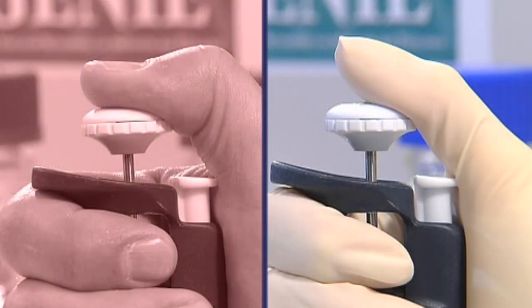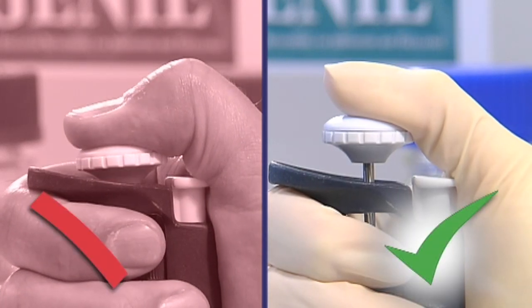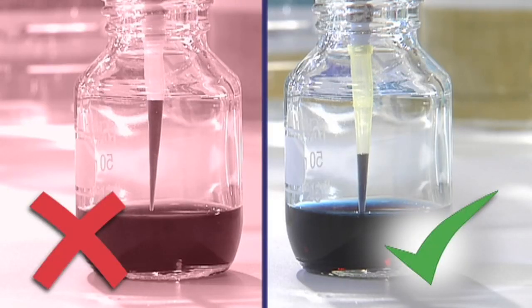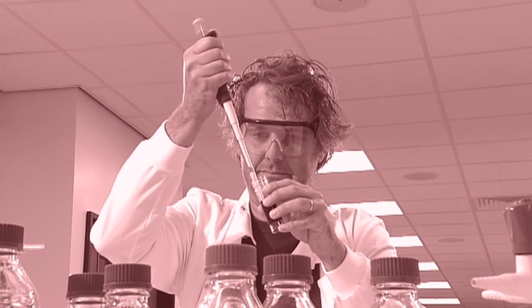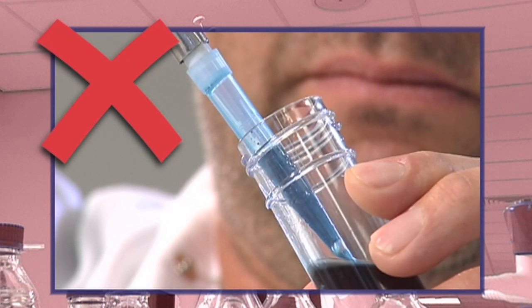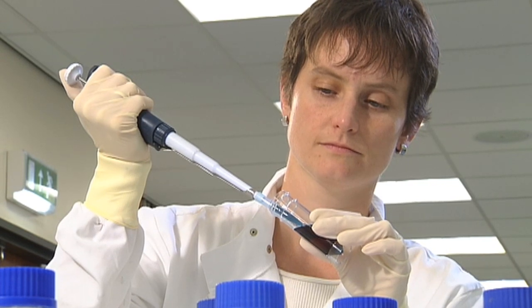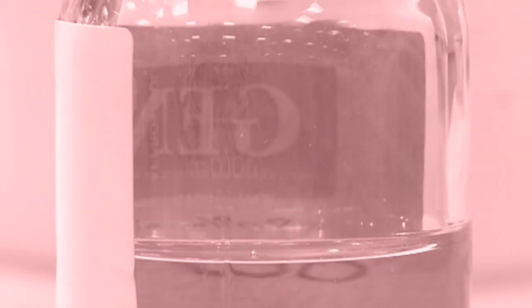When pushing down the push button to take up liquid, don't push past the first stop — if you do, the volume you take up will be too large. When taking up liquids, don't simply let go of the push button, as the liquid can be sprayed around the inside walls of the tip and up into the pipette body, causing inaccurate volume dispensing and pipette contamination. Make sure you release the push button in a controlled manner. If you don't pause after releasing the push button, there won't be enough time for the correct volume to be taken into the tip, and air will be taken in instead.